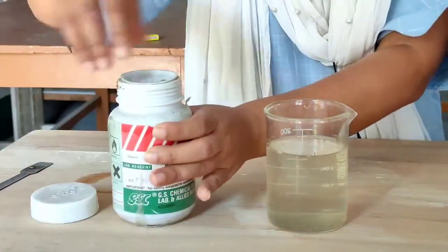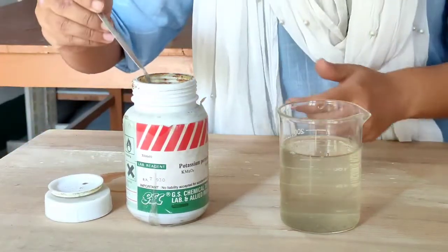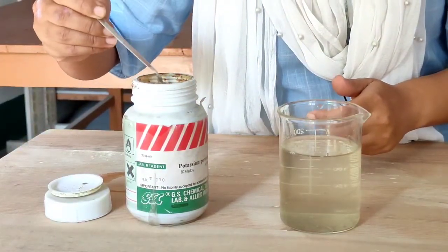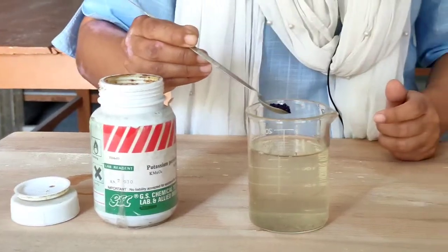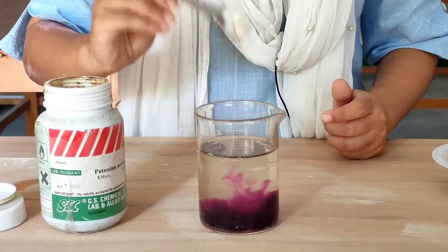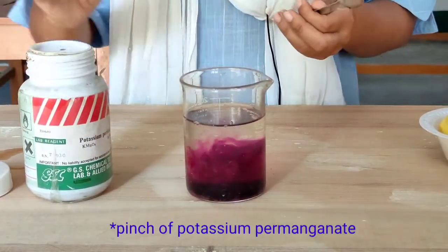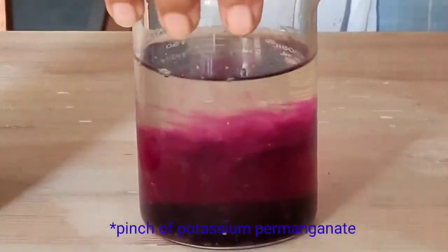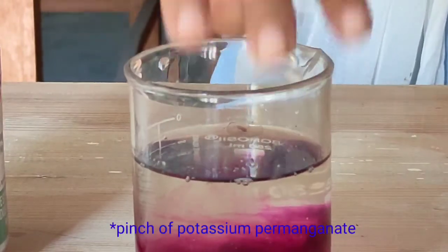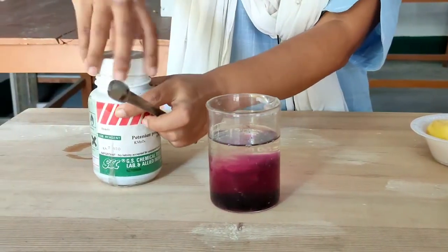What will I do? I will take this potassium permanganate on a spatula. I will just take a pinch of it and then put it on the surface of this water. I dropped that pinch of potassium permanganate only onto the surface of the water, but you can see that the whole water has turned pinkish. Now let this settle for a while.